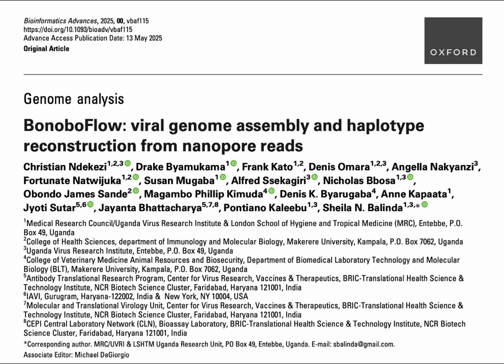Okay, that sounds incredibly comprehensive. Can you walk us through it, maybe step by step, like following a recipe to bake the perfect genetic cake? What are the key stages? Okay, yeah, the recipe analogy works quite well. It's a very systematic, carefully orchestrated process. So you start with your raw ingredients, the sequencing data. Exactly. BonoboFlow takes either raw POD5 files, that's the direct signal output from the sequencer, or FASTQ files, which have already been base called into sequences.